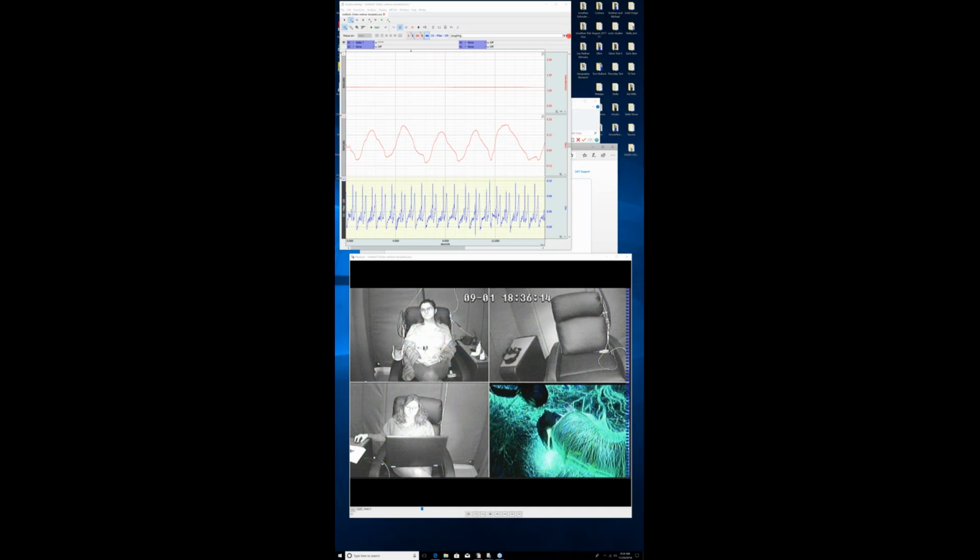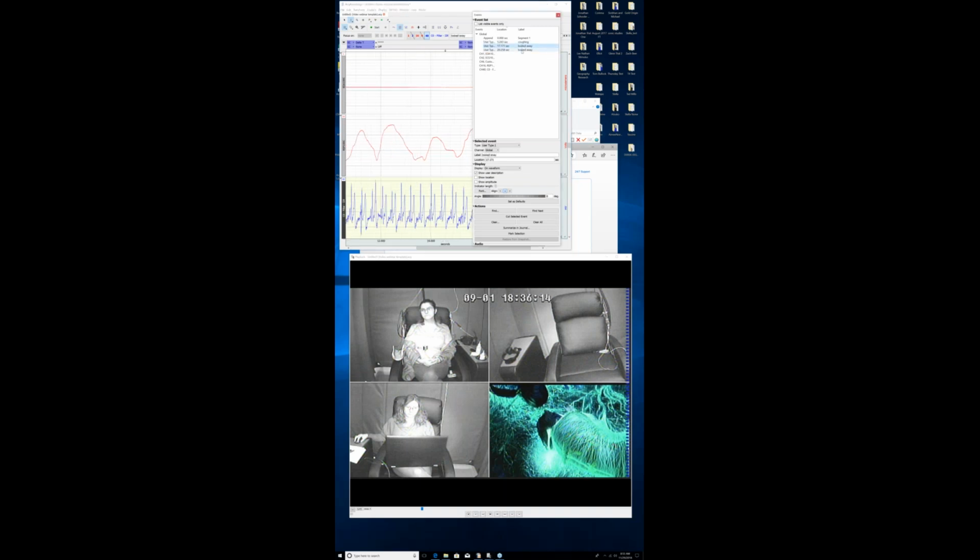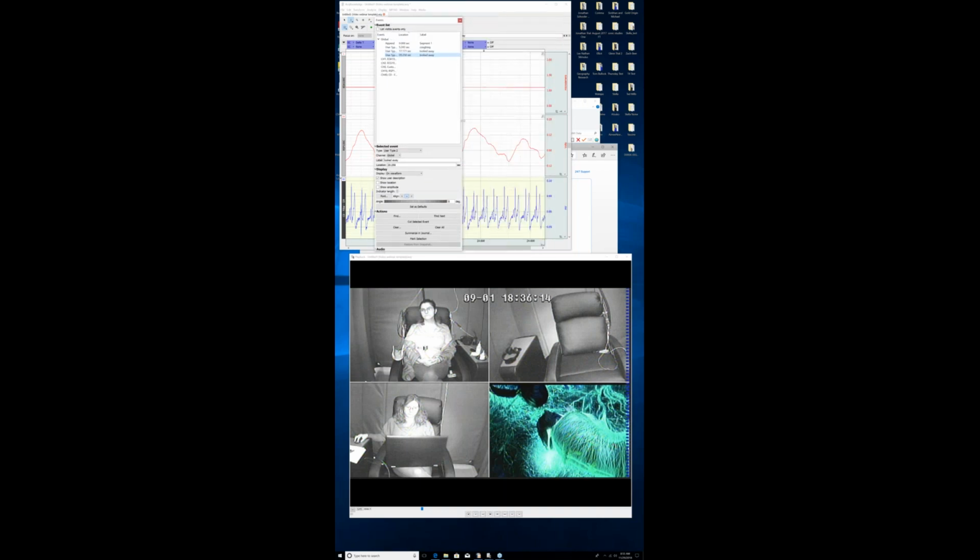Over on the right, under the event information, the event palette, I can open up and view all of them. So I'm just going to go back to normal. I'm going to click on this. So this is the event palette. And you can see this is where I looked away, looked away. These are the labels that I put in. And can you make that bigger? It's really hard to see. You might not be able to on that large screen.